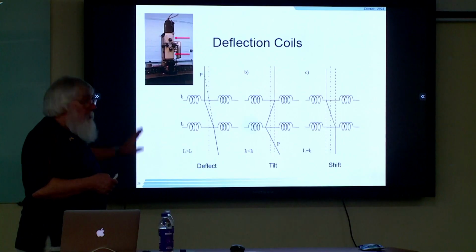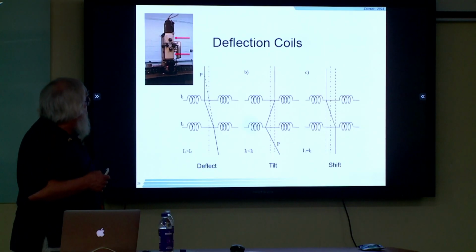Okay, I'm going to skip this. We talked about this before, and we talked about how we do the tilting via deflection coils.